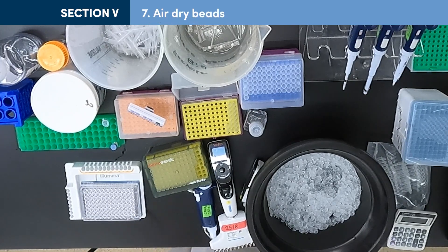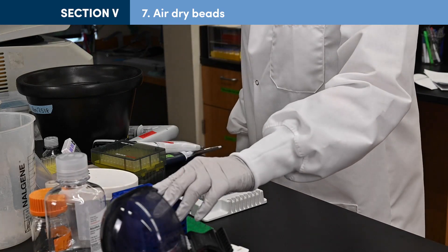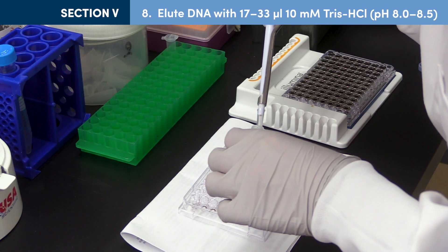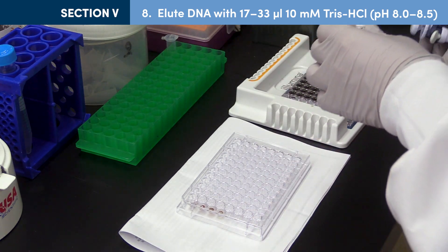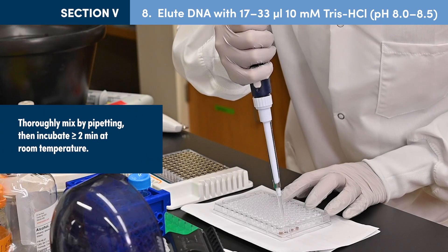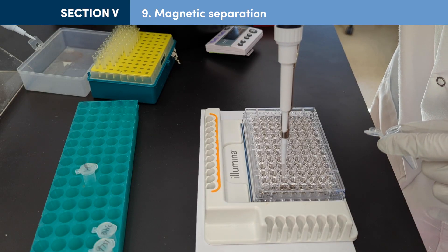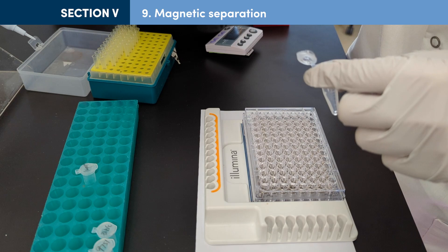With the tube still in the magnetic stand, allow the bead pellet to air dry for up to 5 minutes at room temperature. Similar to the drying step in Section 3, take care to avoid over-drying the beads. Remove samples from the magnetic stand and add 33 microliters of tris chloride to elute DNA from the beads, or use 17 microliters if a higher concentration of library DNA is desired. Thoroughly mix by pipetting up and down several times and incubate at room temperature for at least 2 minutes. Place tubes on the magnetic stand for 5 minutes, then after the solution is clear, carefully transfer supernatant to a new tube, using a volume 2 to 3 microliters less than the volume added.